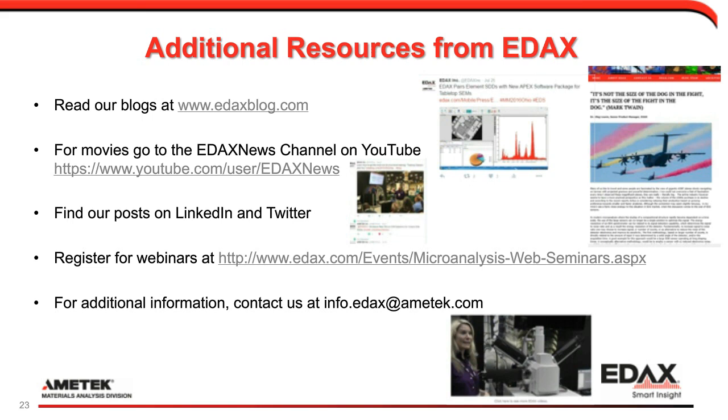I'd like to jump in with just a comment, and the comment is that in the download area, we have a few different pieces of material that you can download. One of them is a quick tutorial on how to do the collection rate and collection time and speed experiment on your own. So if you do want to explore how this particular design works on your samples, then you can download that PDF and try it out on your own samples, on your own microscope, and definitely report the results back to us. We'd love to hear how it works for you on your work, on your samples.